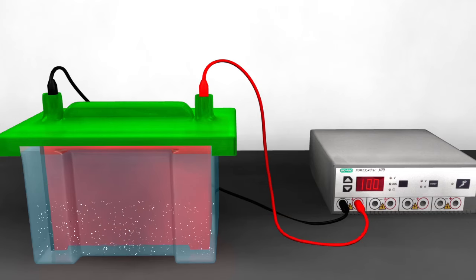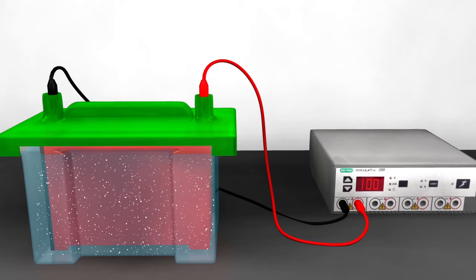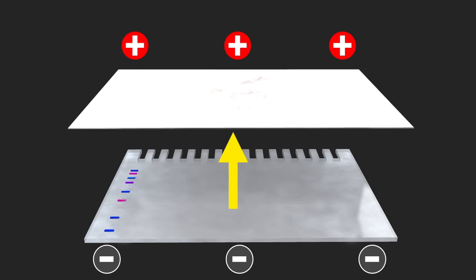When the electric field is applied to the chamber, proteins in the gel migrate from the negative end to the positive end of the chamber, moving out of the gel and into the membrane, to which they become tightly attached.